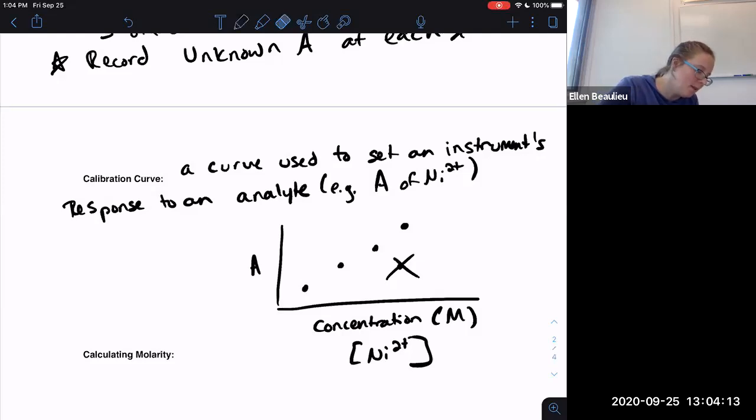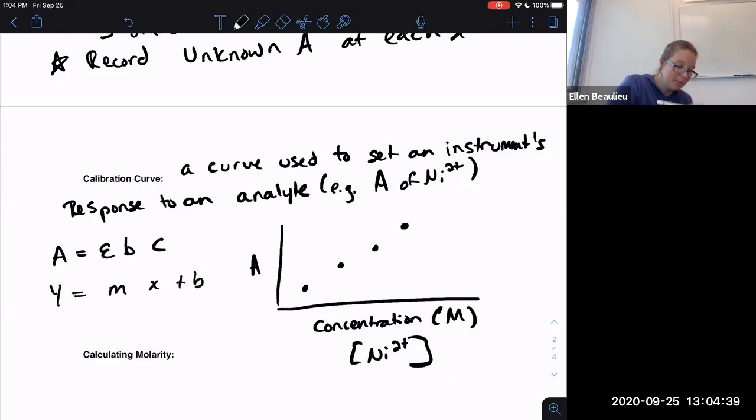In this particular experiment, we took all the data for you, so we know that the measurement should give you a linear relationship, because if you notice it, Beer's law is actually going to be an equation that has a linear relationship. Let me show you how. So let's think about the equation of a line, y equals mx plus b. In this case, your y values are absorbance.